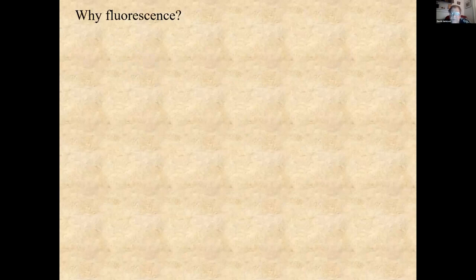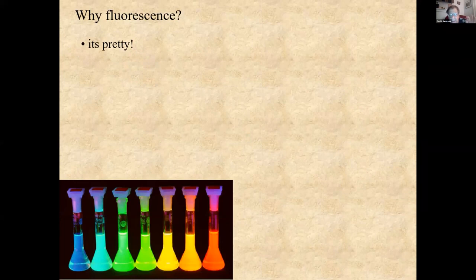So the first thing we might want to ask ourselves is, why do fluorescence? Now, I always like to start off by saying it's pretty, but that's not just a funny sort of answer. When I first joined the laboratory of Gregorio Weber, we'll hear a lot about him later, as a graduate student, he pointed out to me that he was initially attracted to the fluorescence field partly because of the aesthetics of it, the fact that you have these beautiful colors, and by looking at small changes in the color, you understood events at the molecular level. So he always reminded me to always appreciate the aesthetics of it.